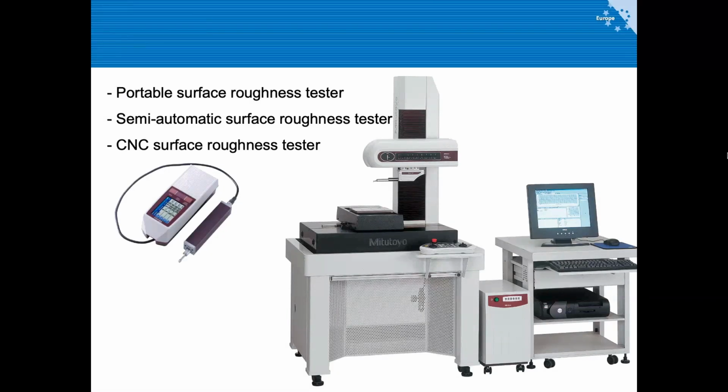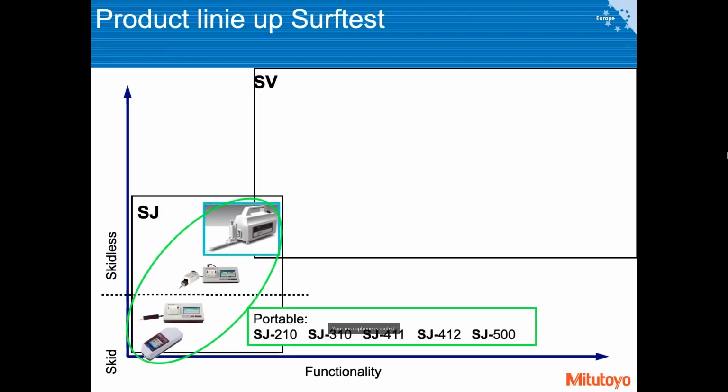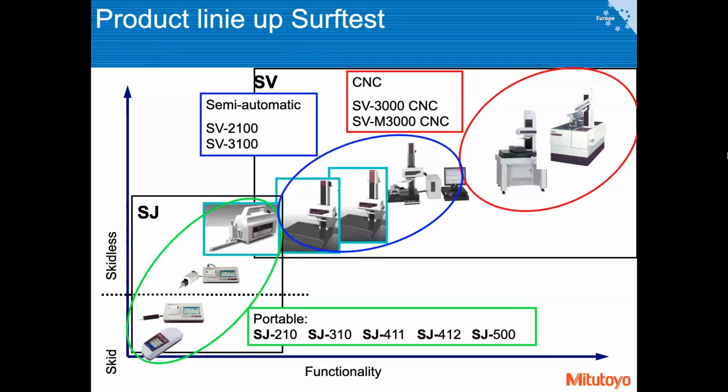So basically you can imagine the profilometer as a big brother of the atomic force microscope. This is just an upgrade level. So yeah, these are the very small tools, and a larger one.